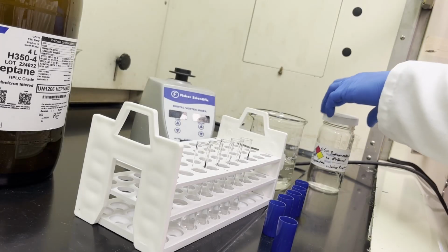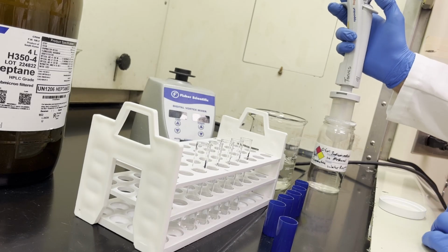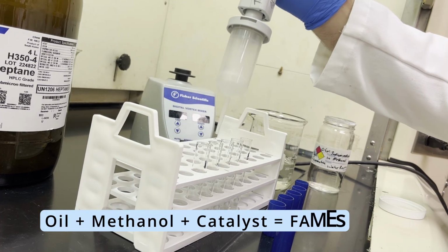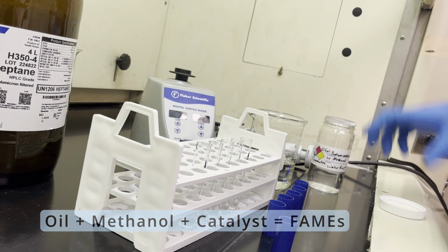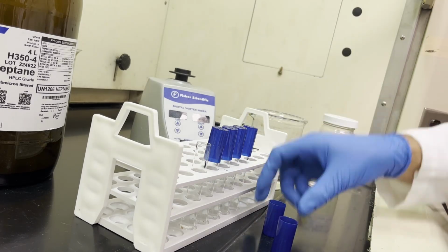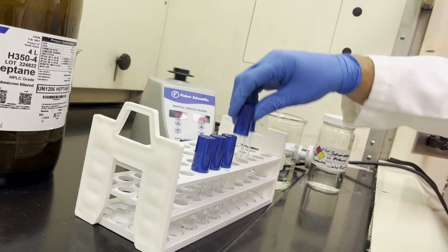At the same time, methanol and a base catalyst are added to chemically convert the oil into individual fatty acids and modify them to produce fatty acid methyl esters, or FAMEs. The tubes are then capped and vortexed to mix the chemical reactants.